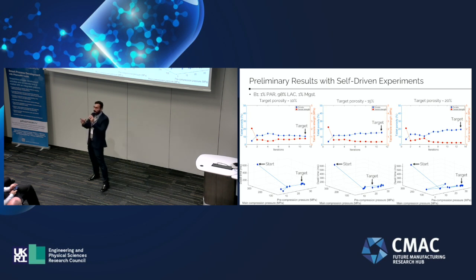One more thing I want to highlight is that the NIR scan may be impacted by the dark and the reference scans. Previously, what we used to do is take the reference and the dark scan only once and keep running the experiments all the time, but that actually changes over time.